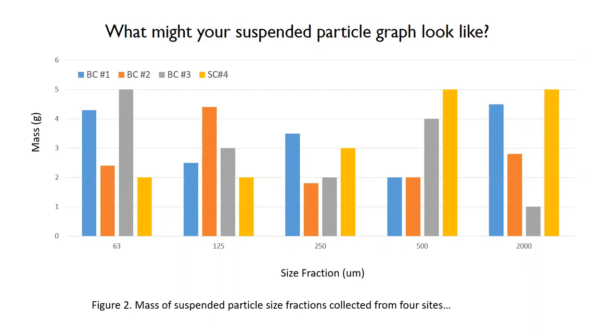And so you can see on our x-axis, we've got the different size fractions in micrometers of the sieves. We've got the mass in grams of samples on the y. And then we have our samples entered here so that for each size fraction, we can compare the amount in each sample. And a couple people did the calculations. It looks a lot different from this.